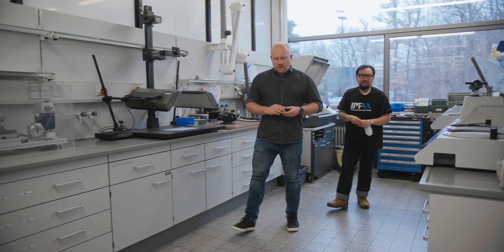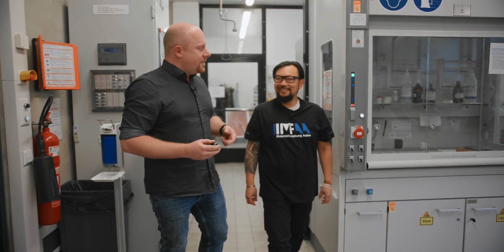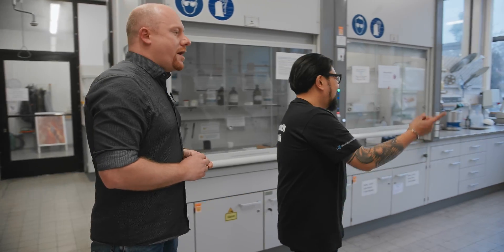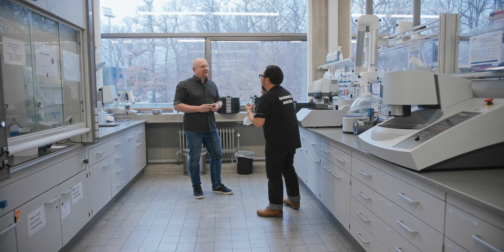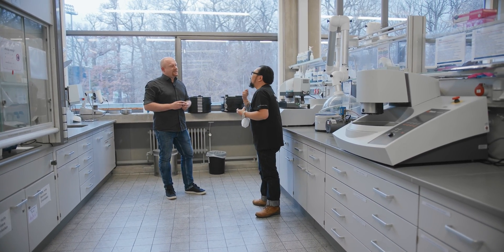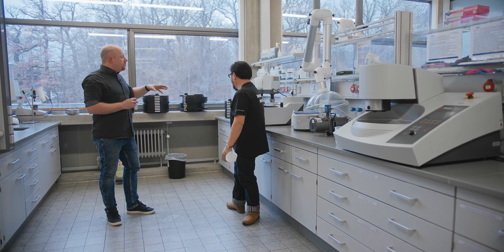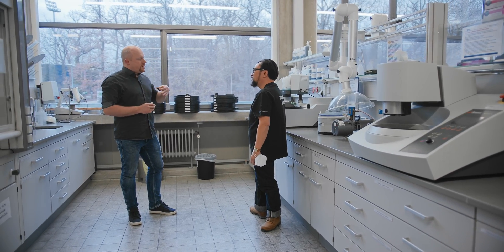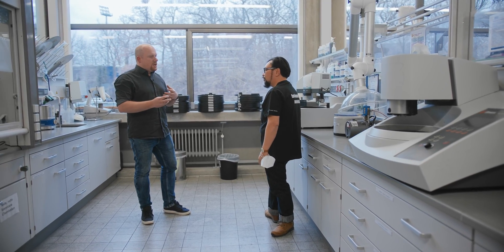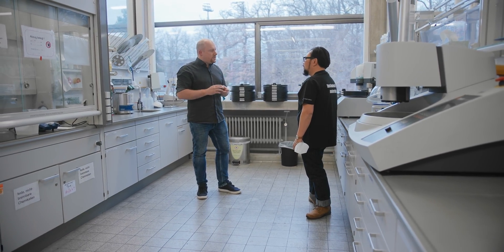With this, we go to the next area here where we do the semi-automated preparation — so grinding and polishing. Our students have to learn to do it manually, but if you are advanced you can go to the semi-automated machines. It's like when my dad first taught me how to shave — he made me use a razor, and after I cut myself over and over again, he gave me the electric razor. Same principle here. These machines take the specimens and press them against the rotating grinding disc where we have different grain sizes, different diamonds, and suspensions to polish away layer by layer and get to a mirror finish.